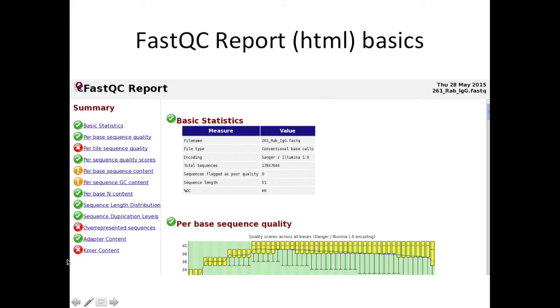And next to these reports, it has this sort of stoplight. Green is go and red is stop. I would not live or die by these warnings, but it will tell you where in your library there may be problems. So let's get into what some of these are.